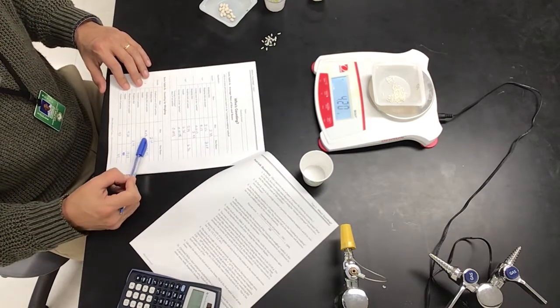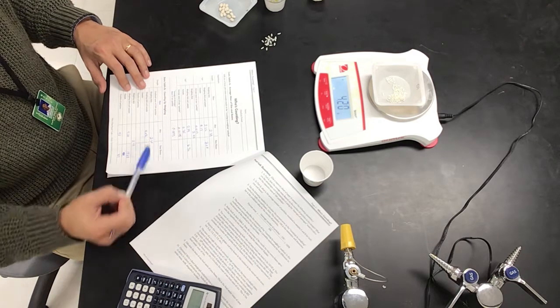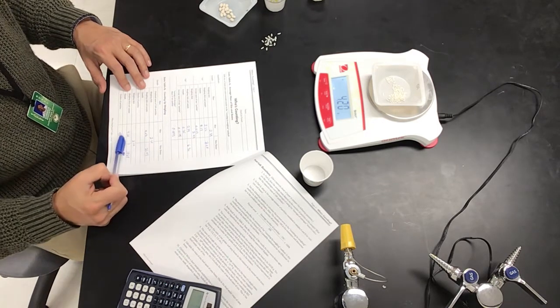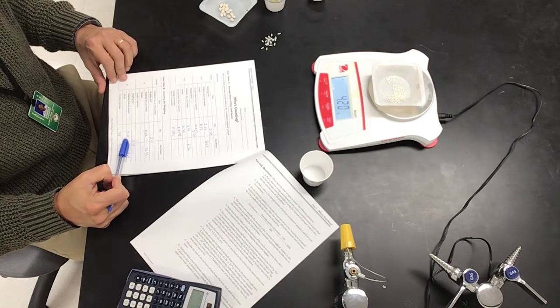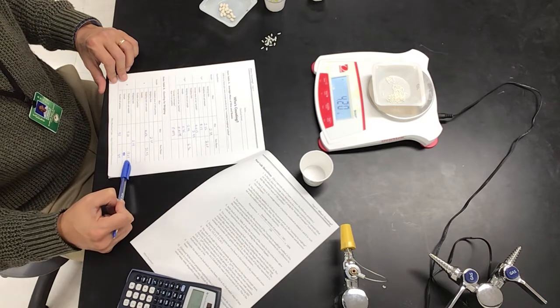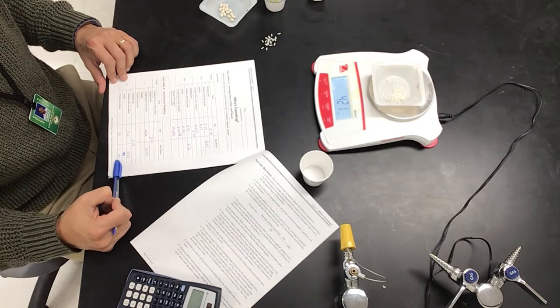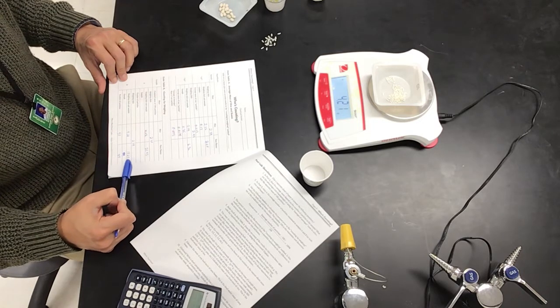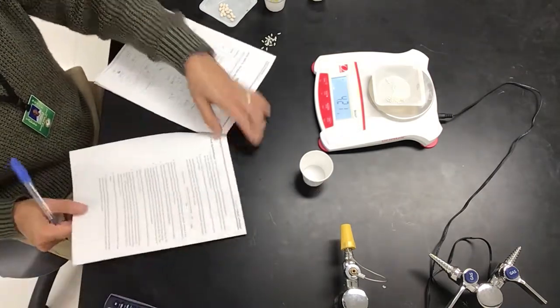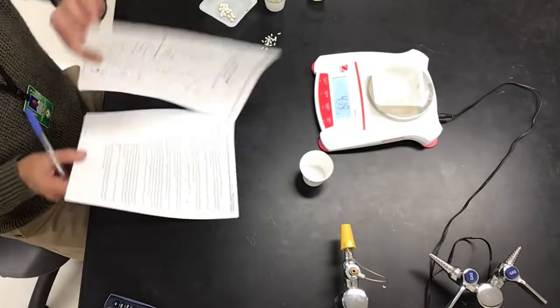So 4.02 for weighing dish and sample, and 21.93 for the navy bean. The mass is still the same. For the B part, 4.20 is 90 grains of rice. For the navy bean, 84, and the mass is 18.64. Fill out the rest, answer the post-lab question, front and back, but just the front, and that's the assignment.